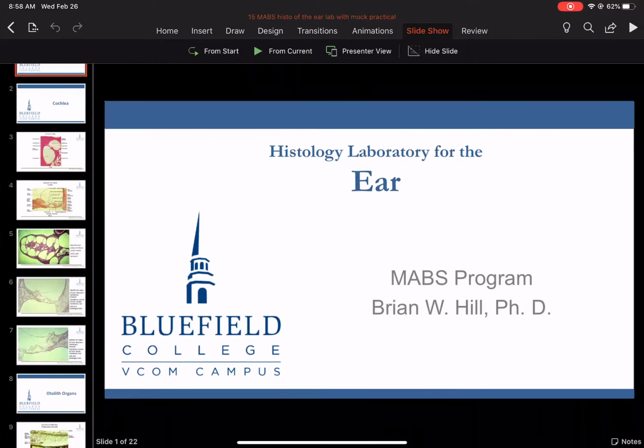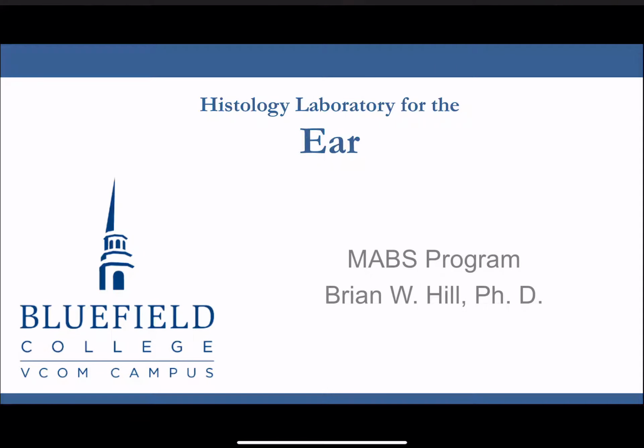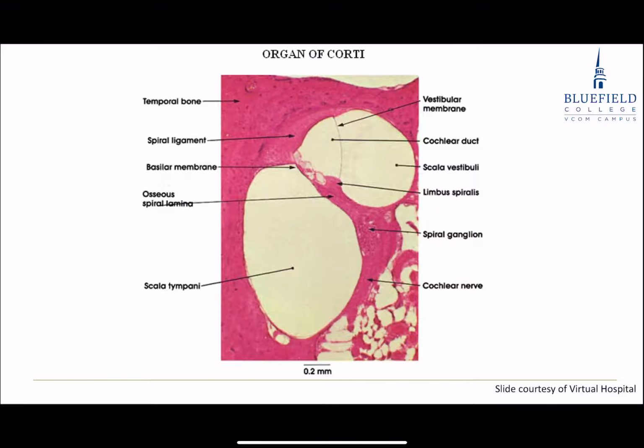So look at this. Organ of Corti coming through here would be right here, but what we're looking at is a cochlea, correct? When you look at it here, the middle one's always going to be scala media. Where students can make a mistake: here's the organ of Corti. Below that's always going to be tympani. Opposite side of that is always going to be vestibuli. Depending on where you are as it spirals around that bony spike, sometimes vestibuli will be smaller than tympani, other times it will be reversed.